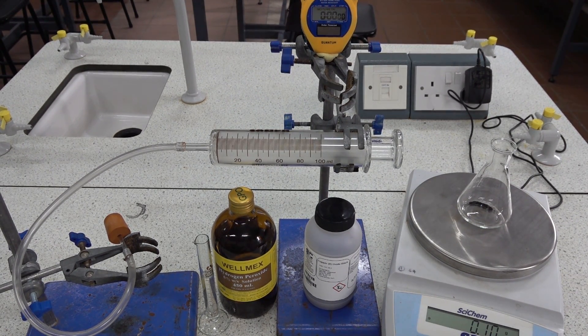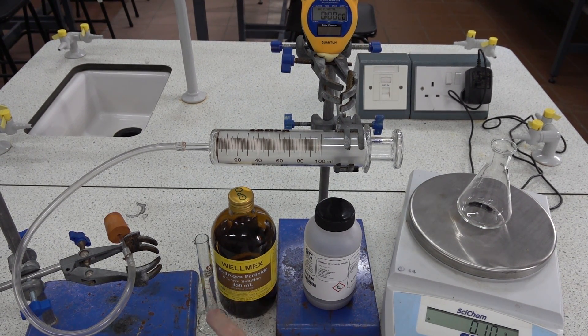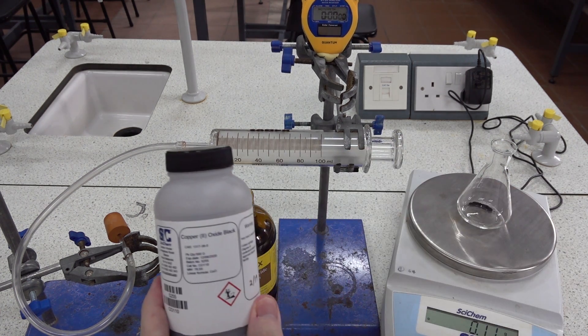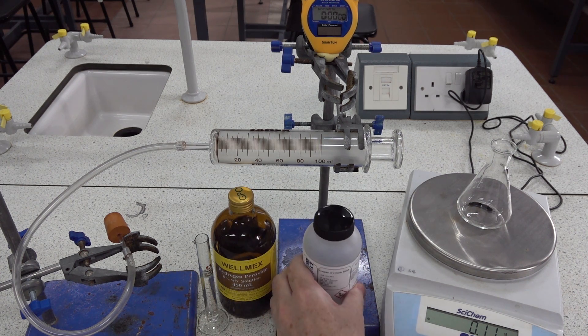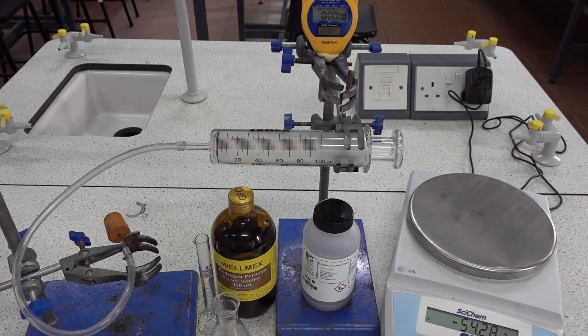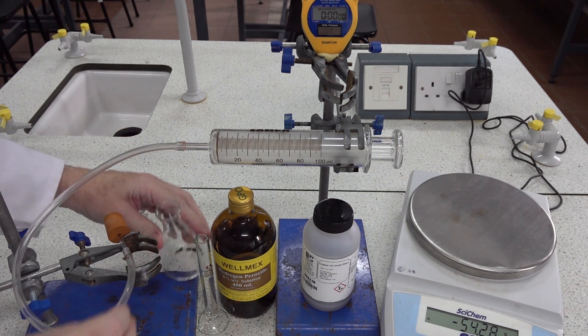Catalyst for the decomposition of hydrogen peroxide. We've got 10 cm³ of 6% hydrogen peroxide in the measuring cylinder and pre-weighed 0.1 grams of solid copper(II) oxide in the conical flask. Clamp the conical flask into position.